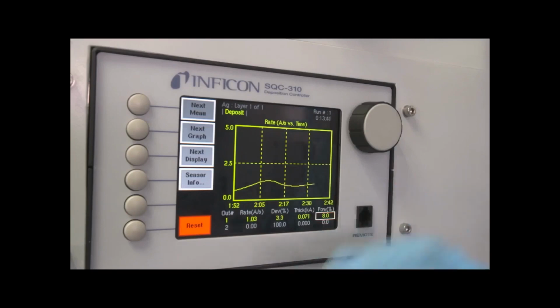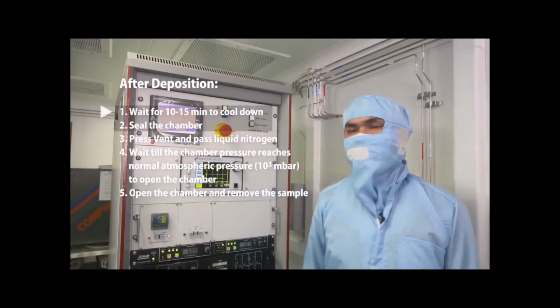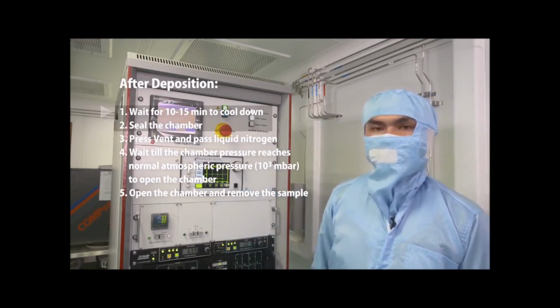As we had said, the final thickness is 25 nanometer, and when it reaches the thickness of 25 nanometer, the whole deposition process will stop automatically. So let's wait till the thickness reaches 25 nanometer. As it has been 15 minutes since we stopped our deposition process, let's now open the chamber.